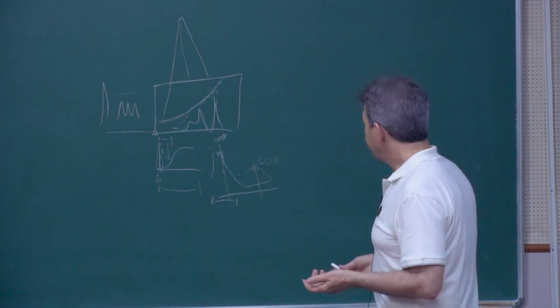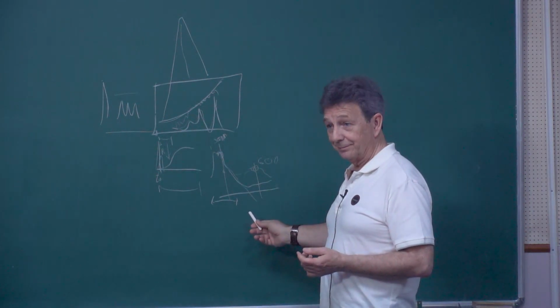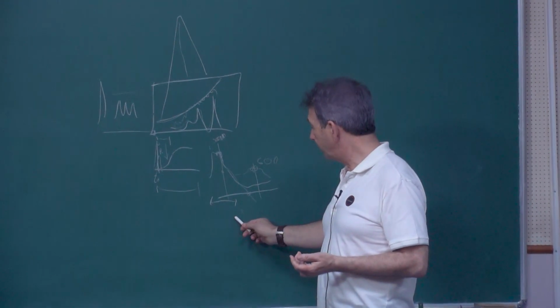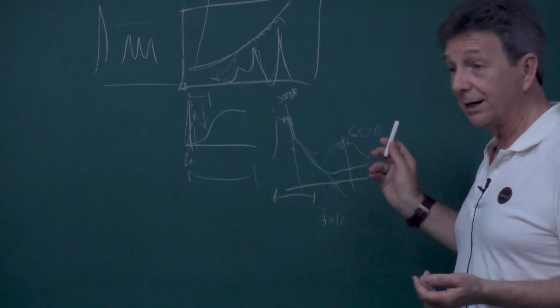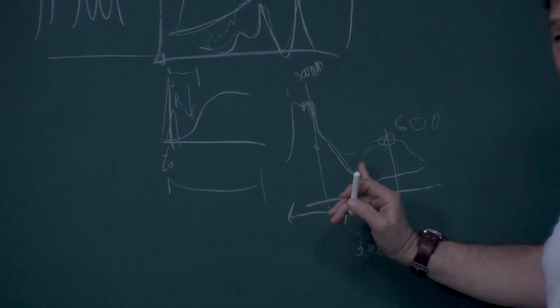Okay, the band gap is basically an extrapolation, more or less, of where you start to absorb. So over here, that will be the band gap of this material, at a given wavelength, and then you say that this is like 3 electron volts. But in the region of the band gap, usually you don't have any significant absorption. So a laser at that wavelength shouldn't be a problem.